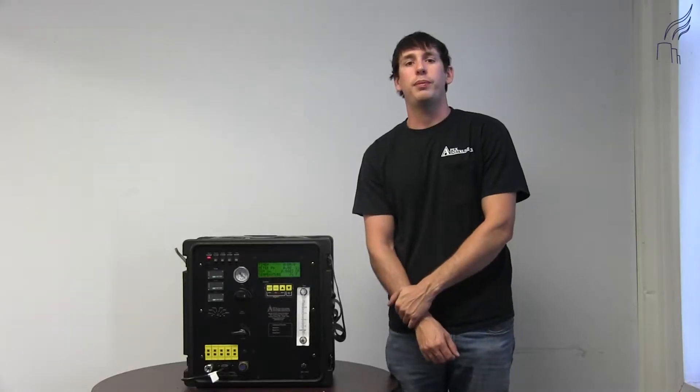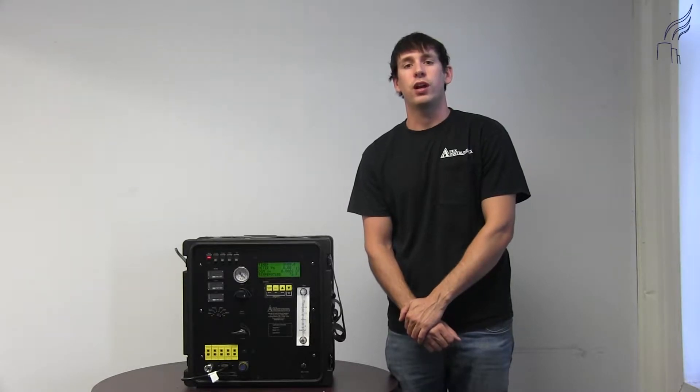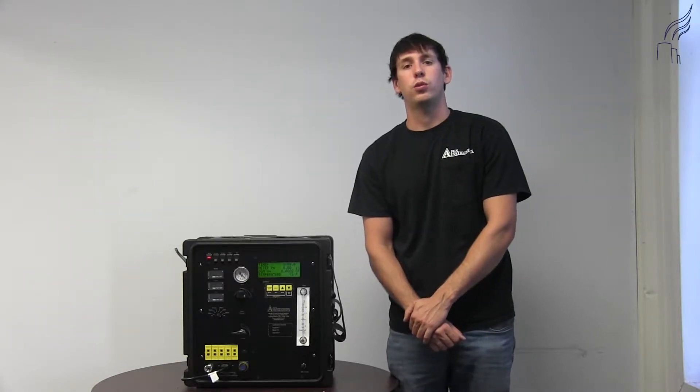I'm Joe Thompson with Apex Instruments Technical Service Group. I'm going to show you how to change the scaling factor for your dry gas meter in your XC623 console.